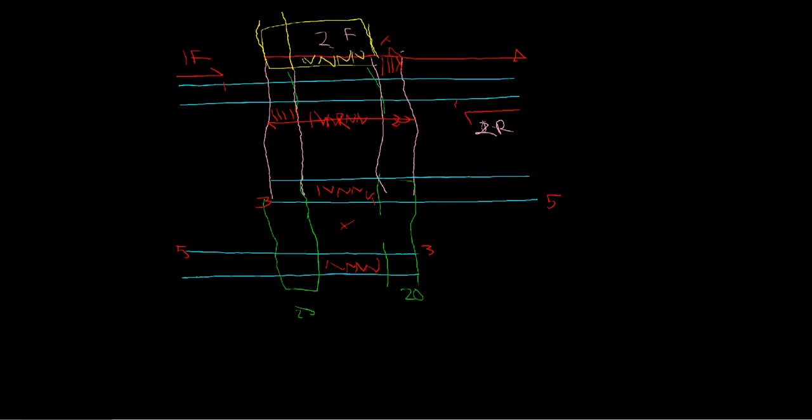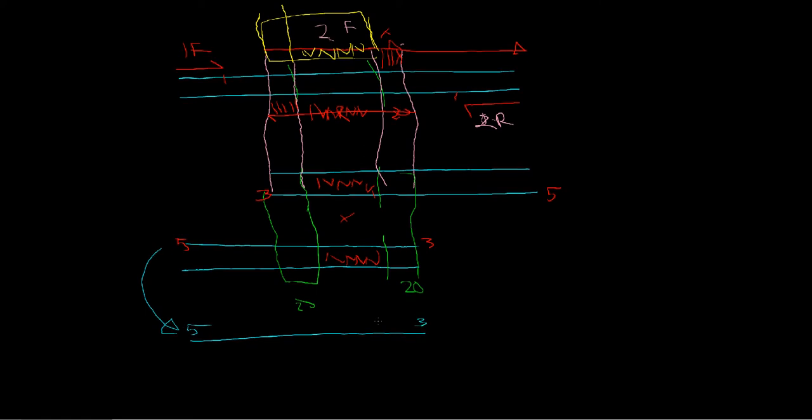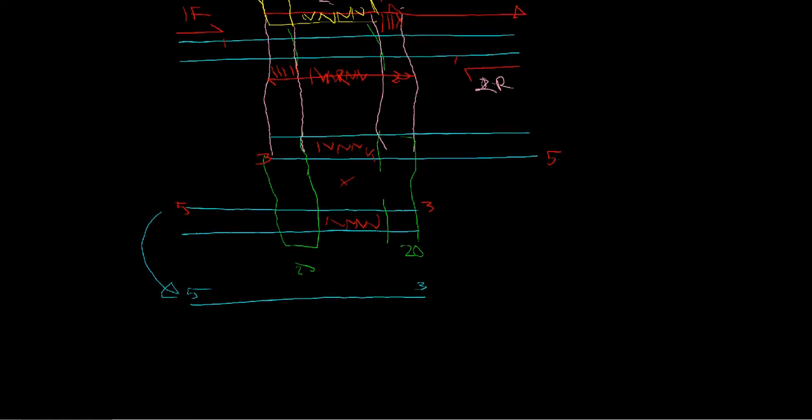And we're going to redraw these so that during the denaturing step, this DNA strand right here, it's 5' and 3', is going to melt, and then our other strand up here is also going to melt. We have our 3' and our 5'.